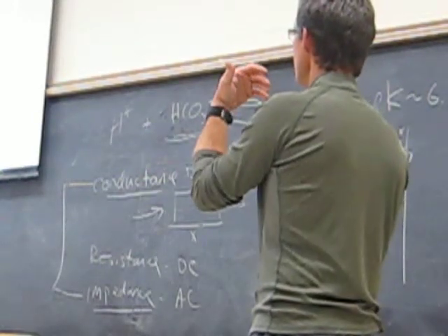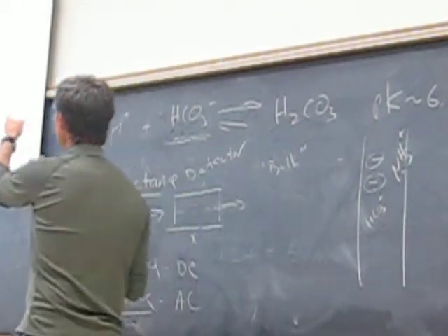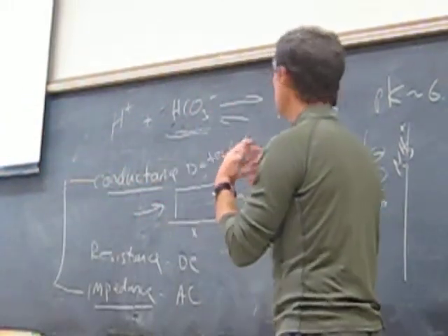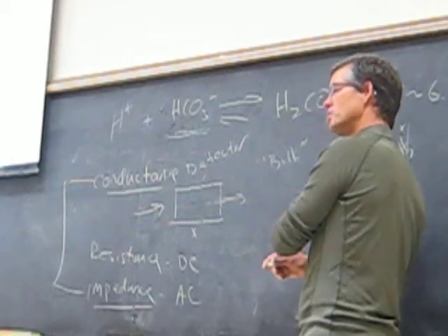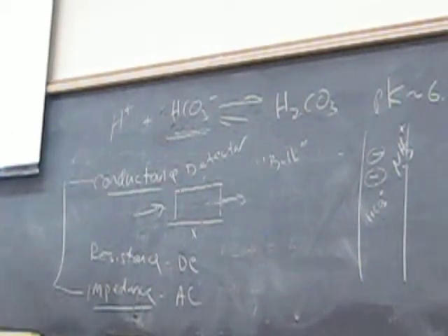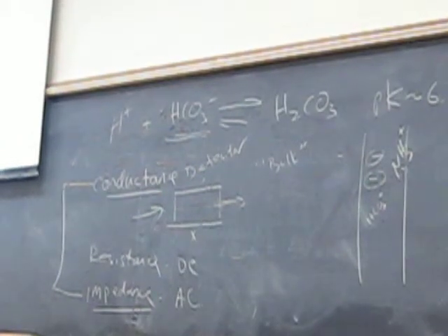The end result is that buying a column from Dionex with a quaternary ammonium group to do a particular separation will oftentimes work differently than if I bought a similar quaternary ammonium column from another manufacturer, because they're all slightly different. And so there's a great niche in developing these kinds of methods, and there are pages and pages of these kinds of applications that these companies publish. There's a tremendous amount.